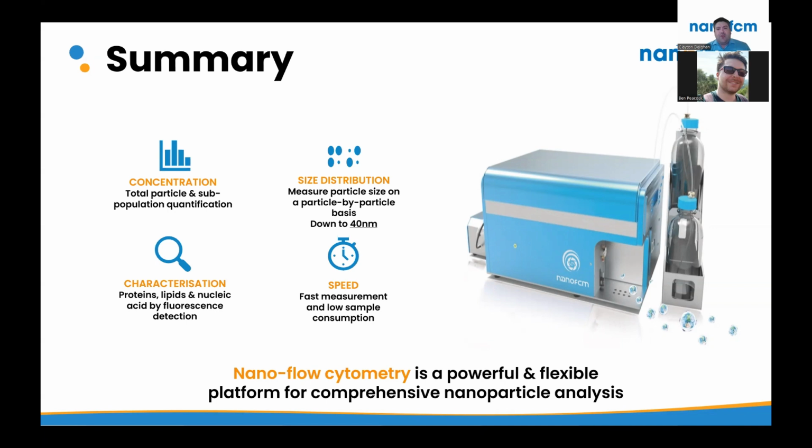And then speed, we're collecting this data in 4 to 5 minutes per sample. You place the sample on, inject for 45 seconds, collect a minute of data, remove the sample. And when you're doing something you've done routinely, you can often process your data to completion in the time that you'll run your 1-minute cleaning before your next sample is ready to inject.